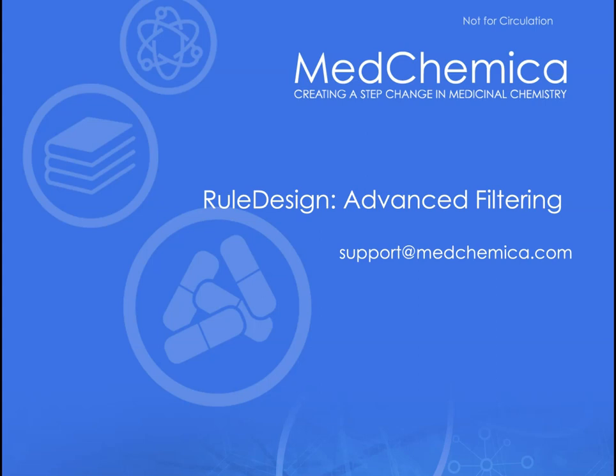The assumption being that you've already been introduced to the methodology behind the RuleDesign tool, you've inputted your problem molecule and goal for improvement, and now you're ready to set the advanced filters to define the compound suggestions you're interested in.